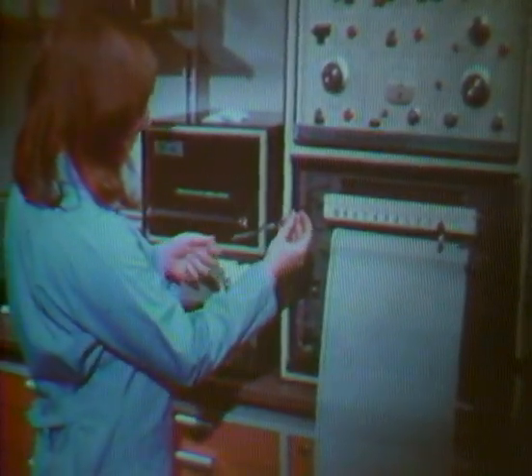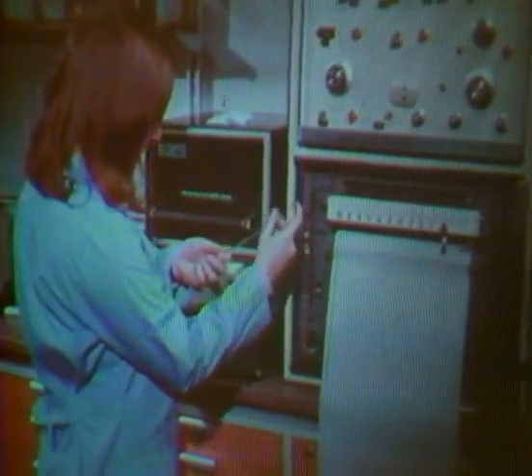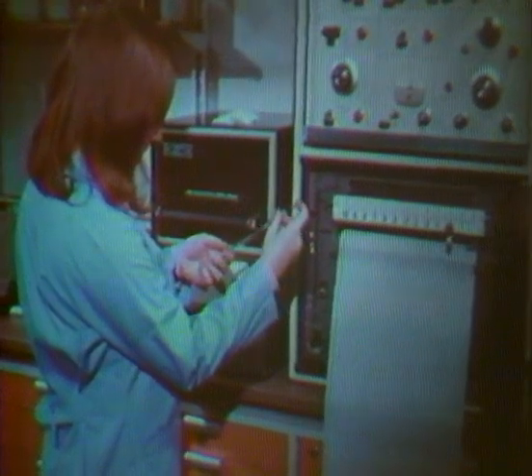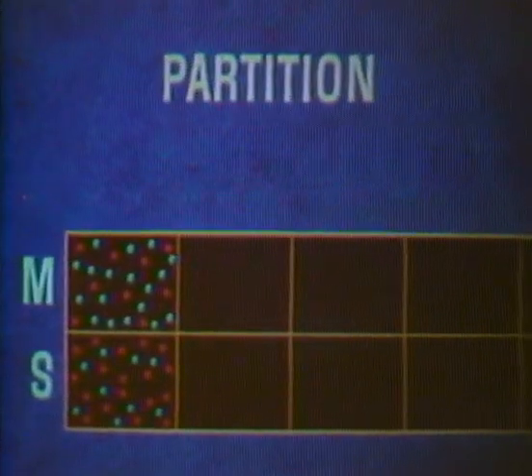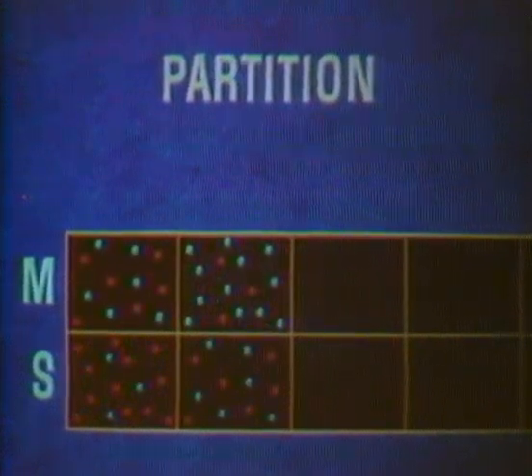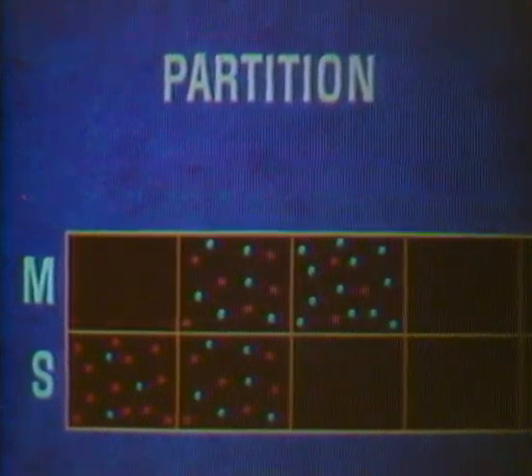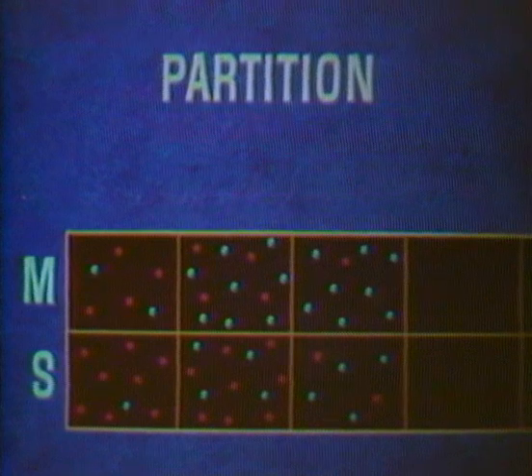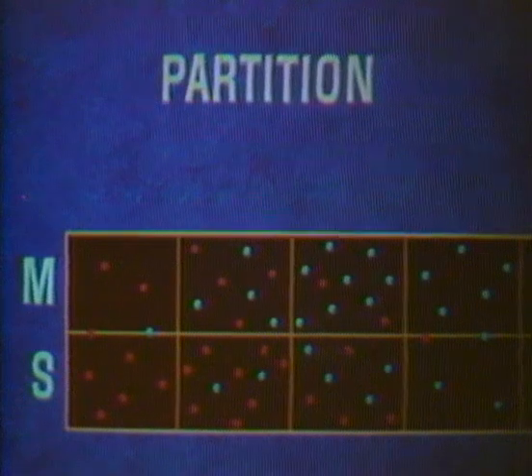In summation, chromatography is a separation technique. It has the ability to perform difficult separations in a relatively short time. It is based on the movement of the components of a sample with a mobile phase over a stationary phase. Each component has a different distribution coefficient between the two phases. As a result, they are retarded by the stationary phase for shorter or longer times, and thus emerge at different times. The relative velocity of a substance is a characteristic value which can be used for identification.